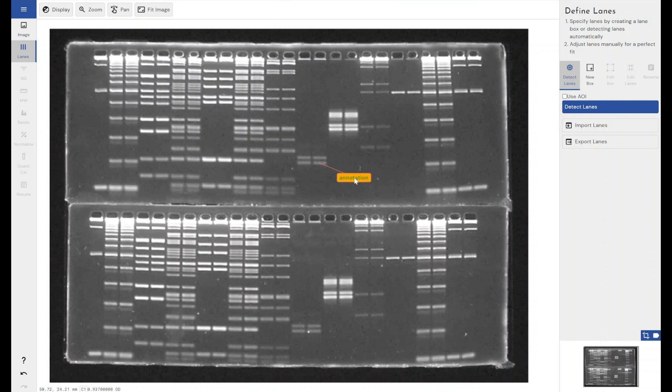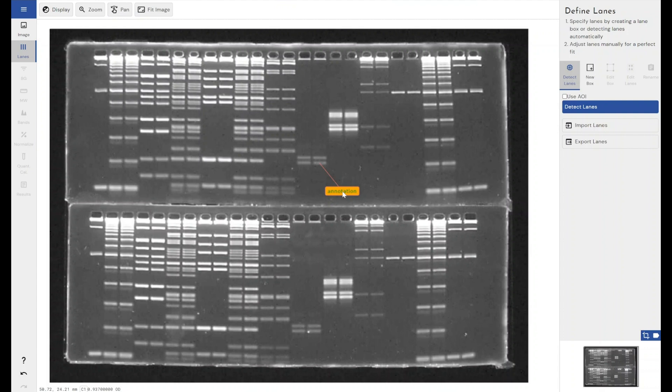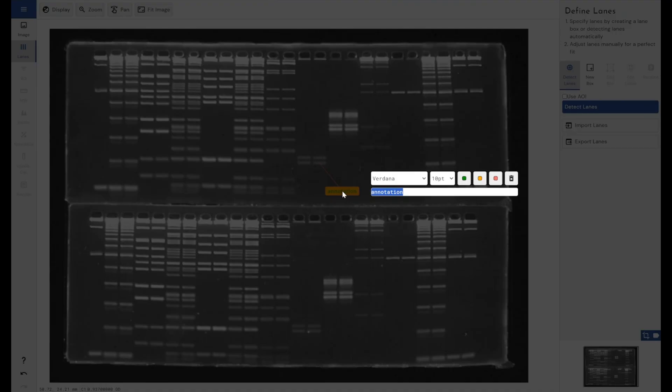Which is super important if you've got a very busy gel, but you still want to add annotations to it. You obviously want the ability to put this annotation somewhere where it's not obscuring other data. So then when I've finished with my annotation, if I release my left click, you can see we go into the edit mode for the annotation.